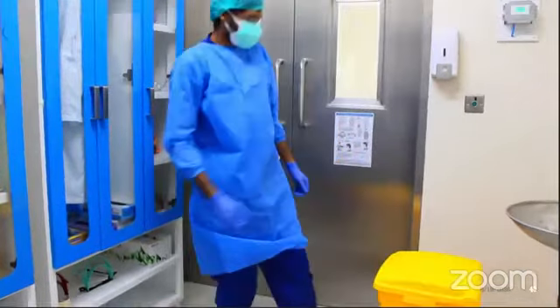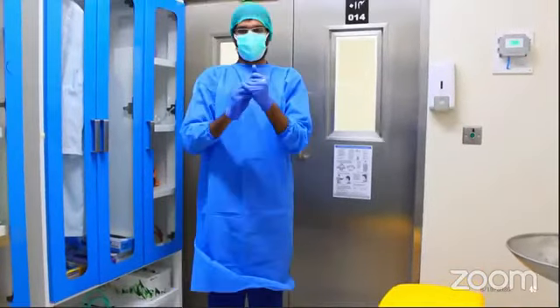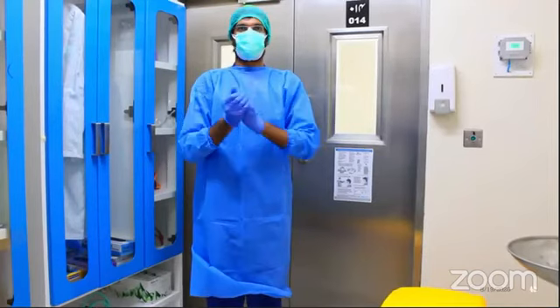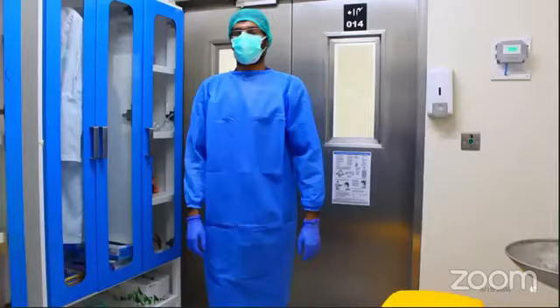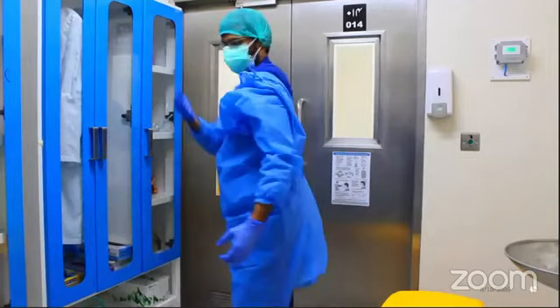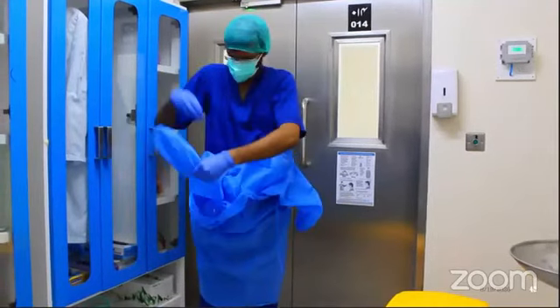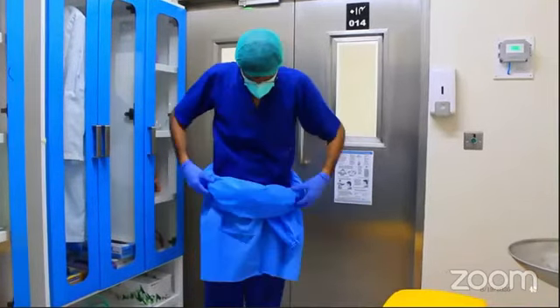Put all PPEs in a leak-proof biohazard bag. This is for infectious waste. Now again disinfect the gloves. Now break the apron by pulling from the neck and waist. Use the hand again inside out way. Remove it by rolling it inside out.